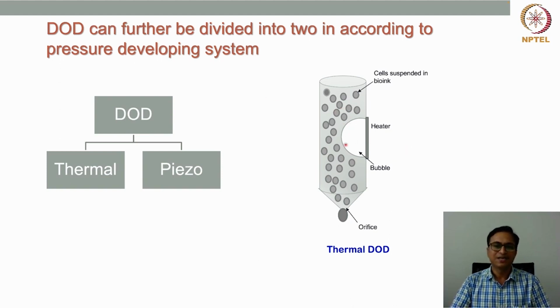To prevent the flow of this liquid backward, a neck kind of geometry is created toward the inlet side. That's why the liquid cannot go back towards the inlet, but is pushed through the outlet, or the orifice, where the droplets are being created, right?